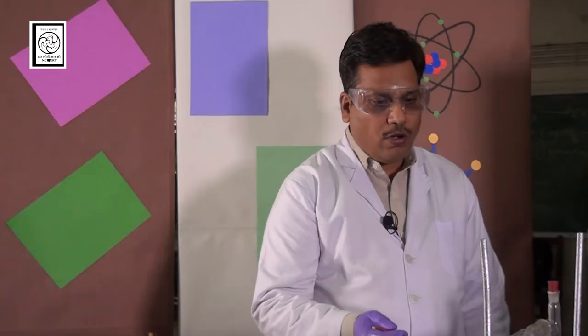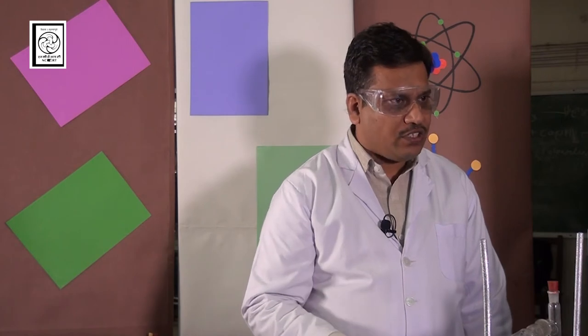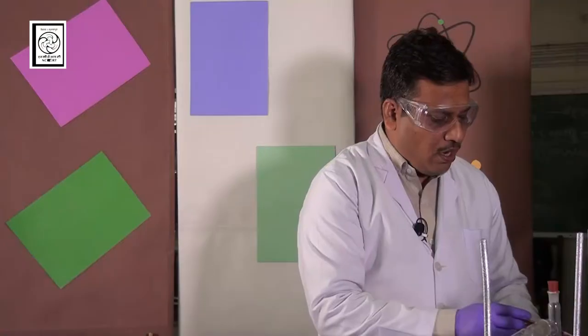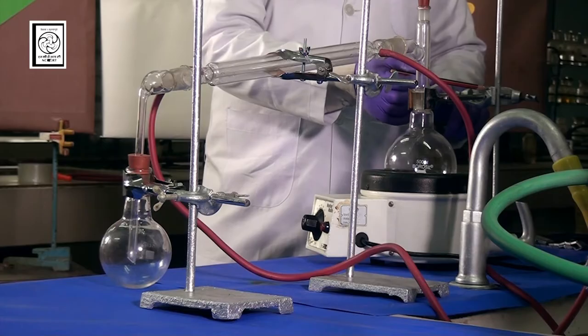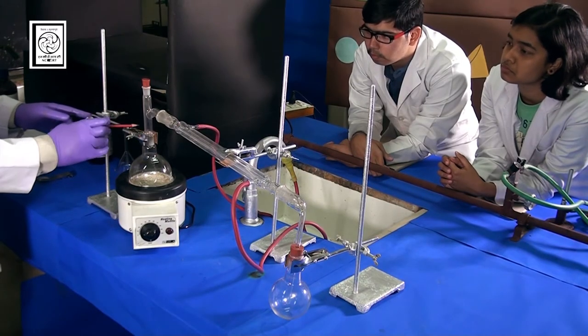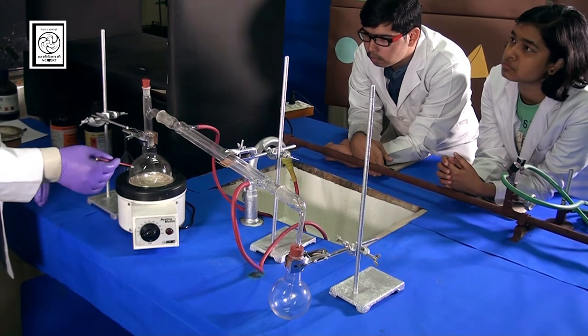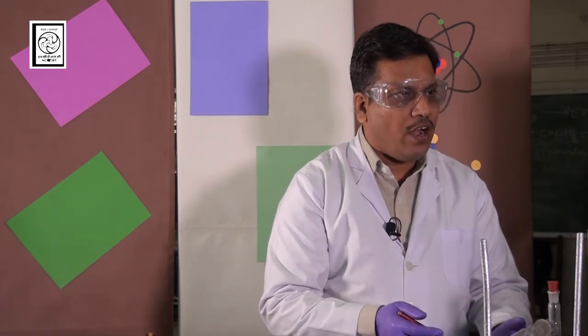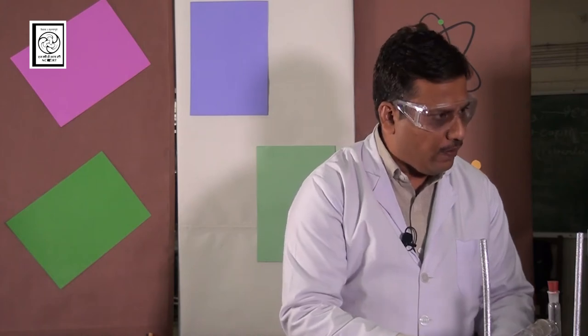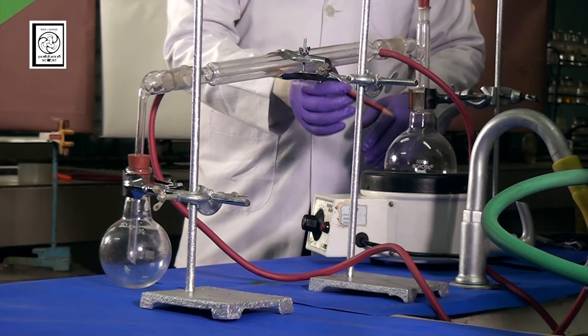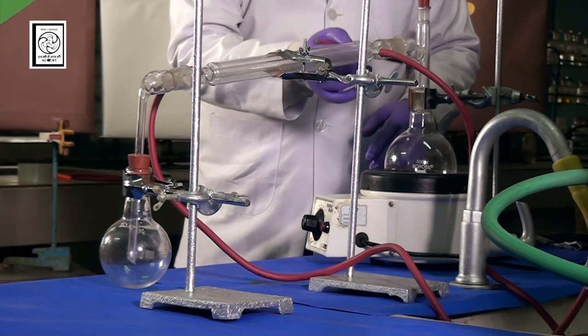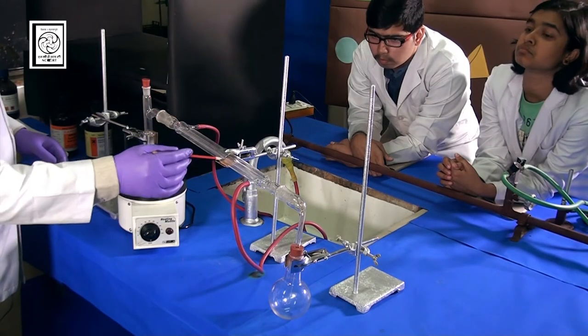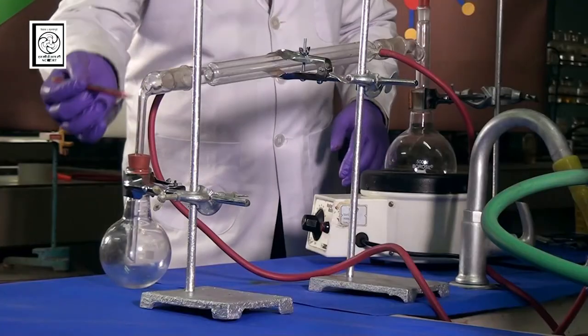So students, for understanding the process of simple distillation or to carry out the distillation process we need an assembly. This is a clamp stand. Now here this is clamp holder and this is hook clamp. A round bottom flask that is also called distilling flask. The capacity of distilling flask you can use around 100 to 500 ml. Here we have taken 500 ml round bottom flask. This round bottom flask or distilling flask is connected with a two-way adapter. This adapter connecting with Liebig condenser and this condenser again connected with receiving flask.